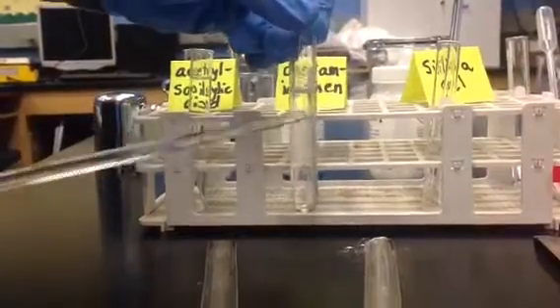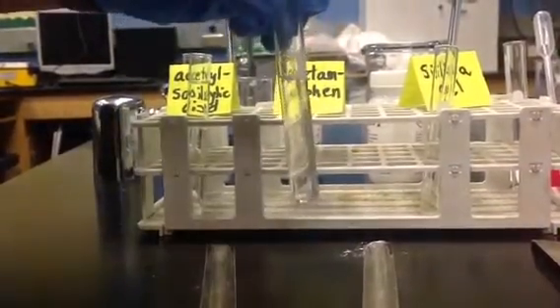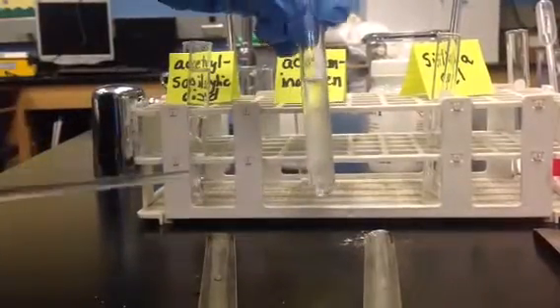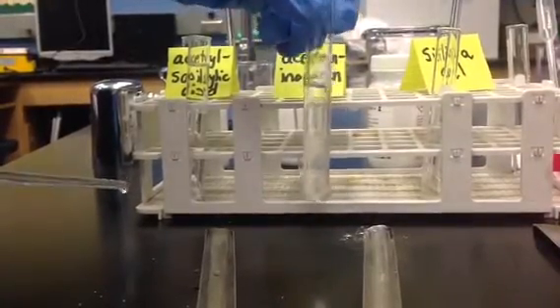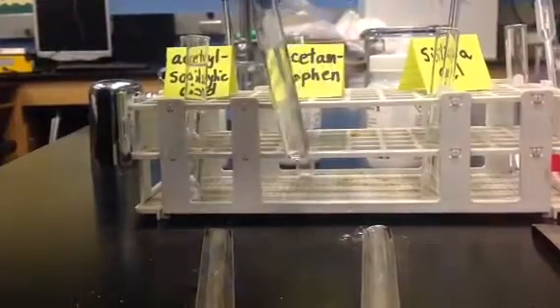Now, if there was any solid that wasn't dissolved by the ethyl acetate, it will maybe move up into that ethyl acetate layer. But it looks like it's all dissolved, and that's just the boundary between the water and the ethyl acetate.